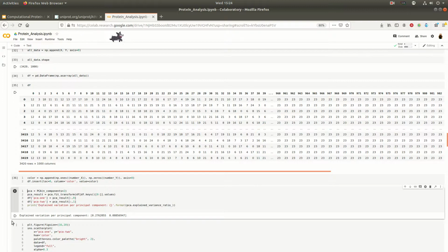If you notice here in this cell right here, the actual PCA is only 2 lines. So we've already spent 36 cells just getting our data organized, which is very important and tedious. And then the actual PCA model is only 2 lines. You're going to see that a lot. Taking time to organize your data is normally the biggest and hardest step, and the models are very easy.